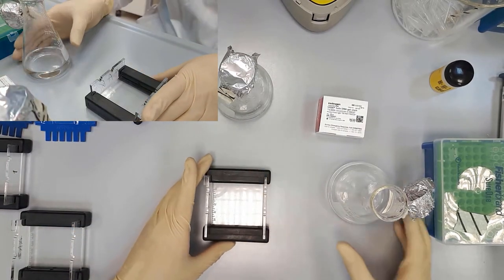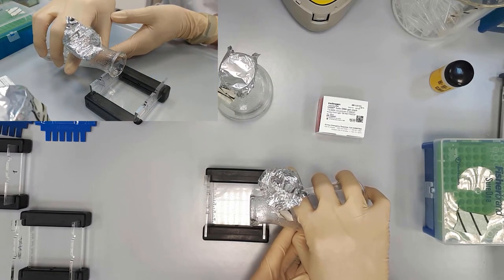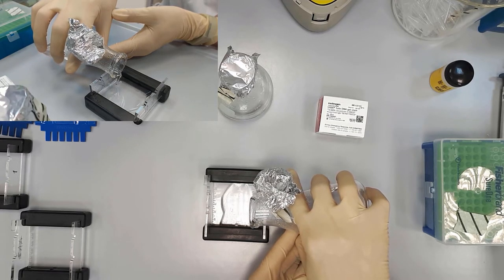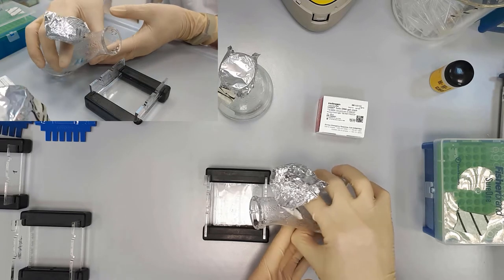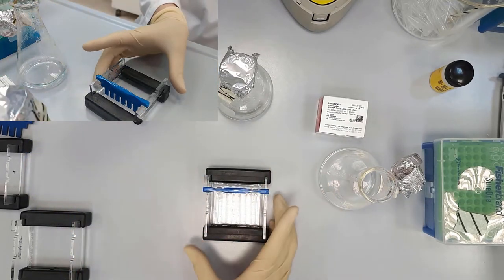We also have the other one. So again, pour it slowly so that we do not bring in any bubbles. This should be enough. Place a comb and put it aside.